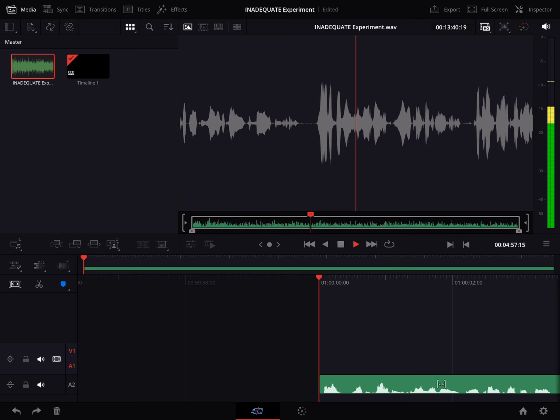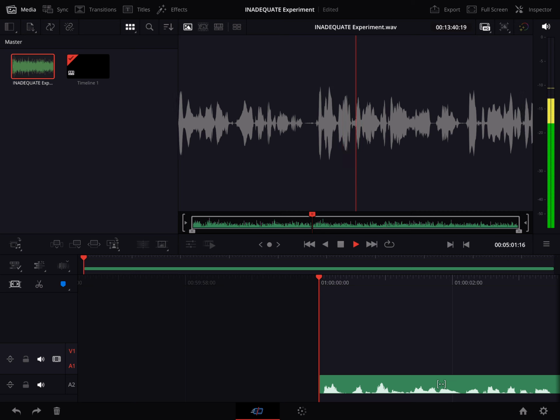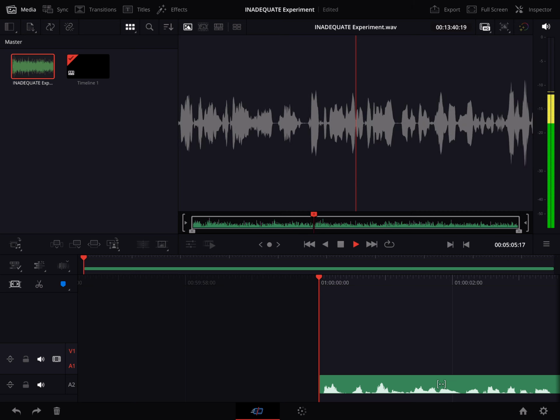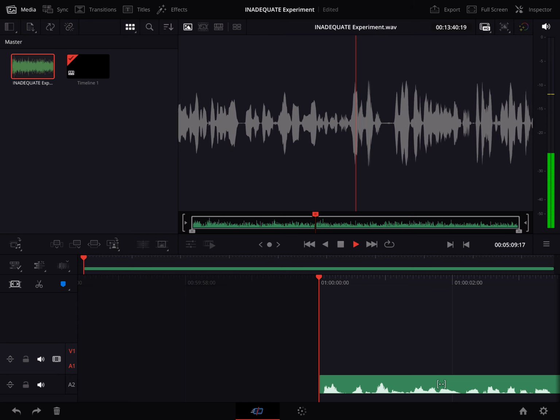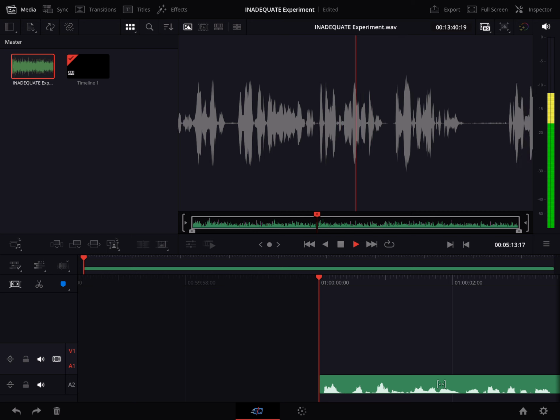One of the big ones is when you're dealing with really complex molecules, especially those with a lot of carbon atoms that are kind of all in similar environments. So, like, if you were using regular carbon NMR, it would just be this jumbled mess of signals. Yeah, exactly. It would be like trying to find a needle in a haystack. Okay, I can see how that would be a problem.